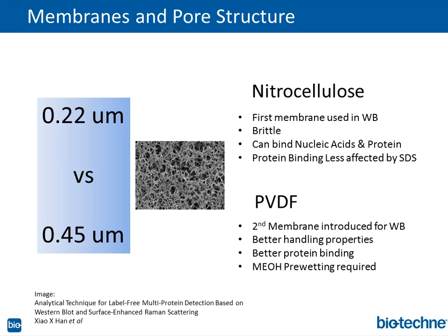So typically you go into 100% methanol for 10, 15 seconds, and then into high purity water, Milli-Q water, or whatever high purity water system you're using, and then into your transfer buffer. You want to do that nice phase change, it's almost like reverse phase chromatography. You've got to be in the same phase to get really great binding. I mentioned, by the way, what you're looking at here is the internal pore structure of membranes.